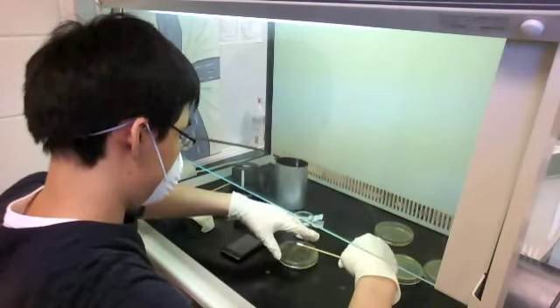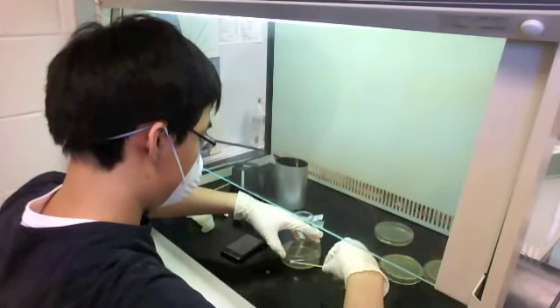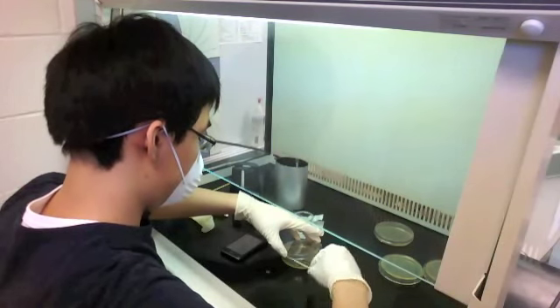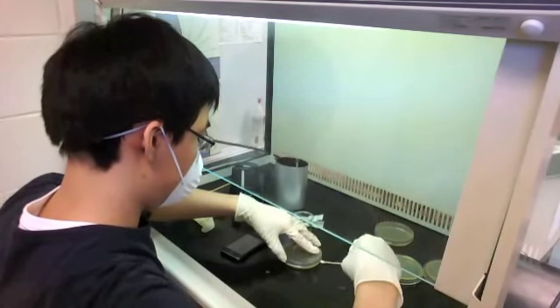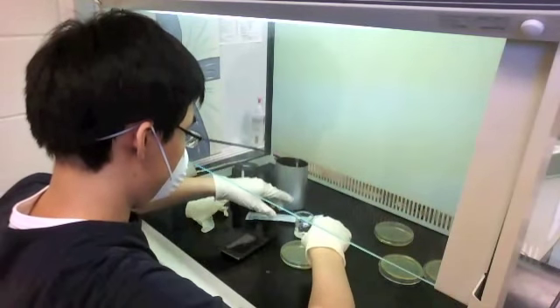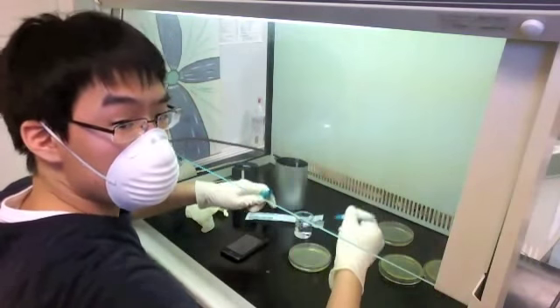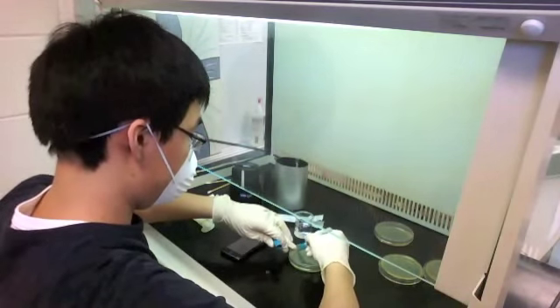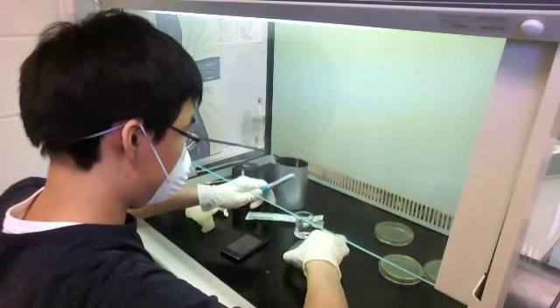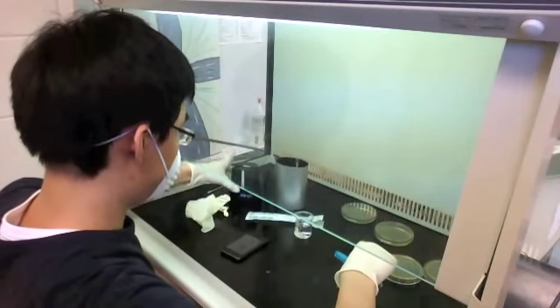I know some of you were going to say the keyboard section is a little dirtier because you use it more, so that's why I'm sweeping up and down — to get half the keyboard and half the top screen. I'm swabbing that onto the petri dish very thoroughly to get an even coat, then throwing the cotton swab into the disposal area of the flow hood. I'm renaming the plate as 'before' and setting it aside.